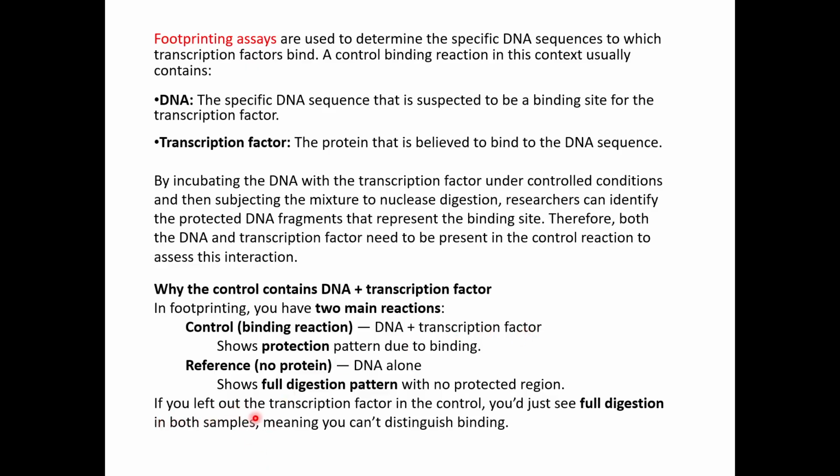So if you left out the transcription factor in the control, you also see a full digestion, like in the case of reference. So in both samples, meaning you can't distinguish the binding. So that is why you need your transcription factor in the control.